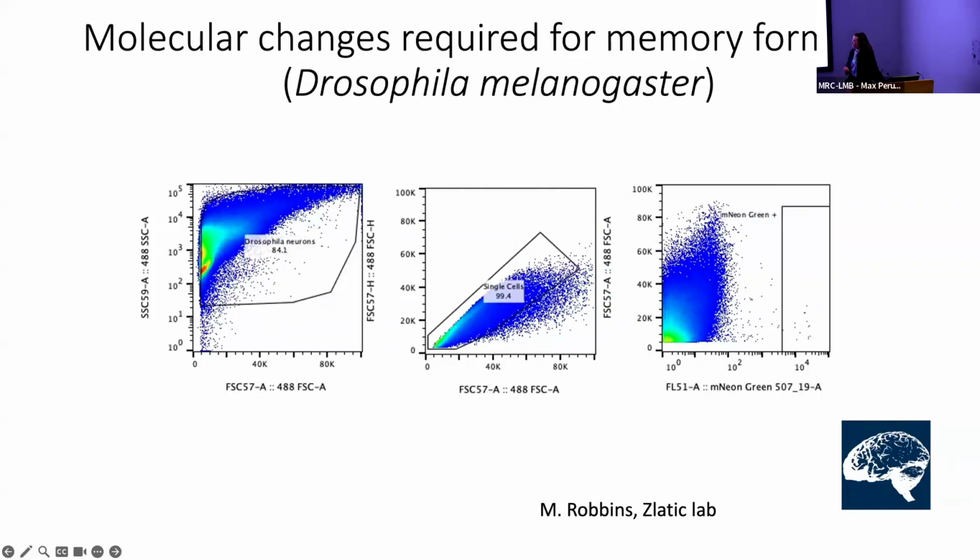But the other extremely challenging part of this project is actually getting enough cells. She's labeled these cells with either tdTomato or neon green, and you can appreciate here from the plot that they're quite rare. So again, making sure that we are optimizing the settings on the sorter to get her as many purified cells of interest downstream for her experiments is really key.